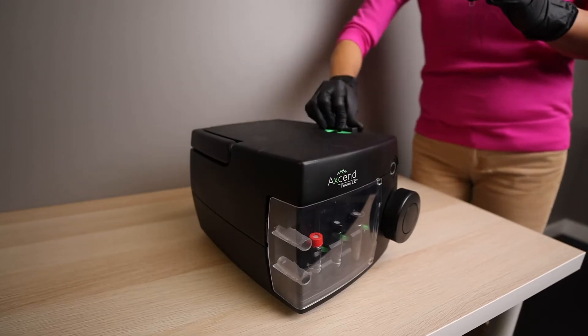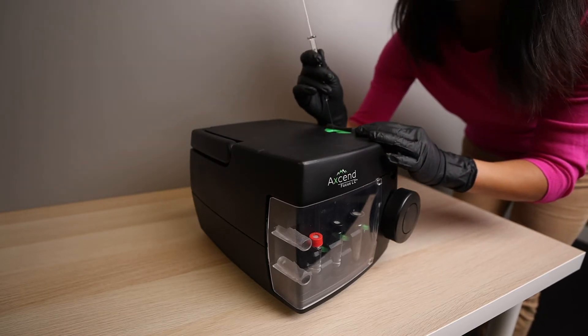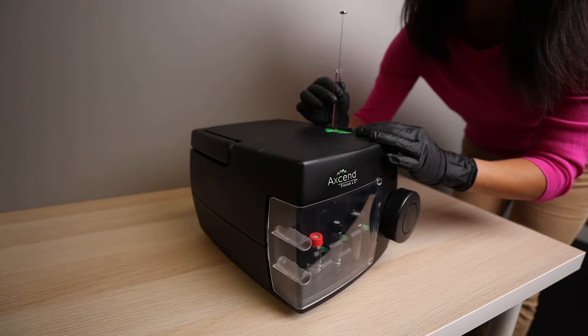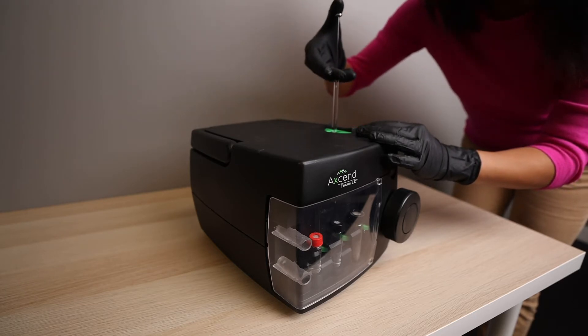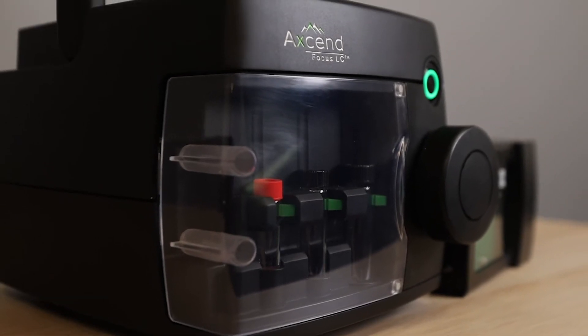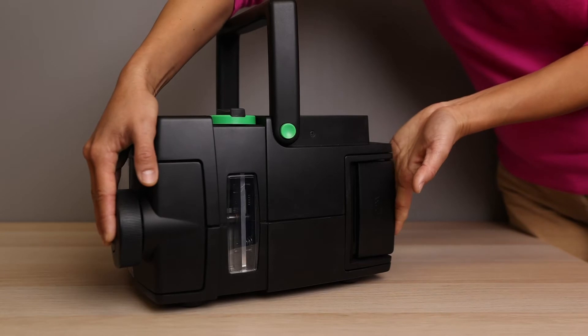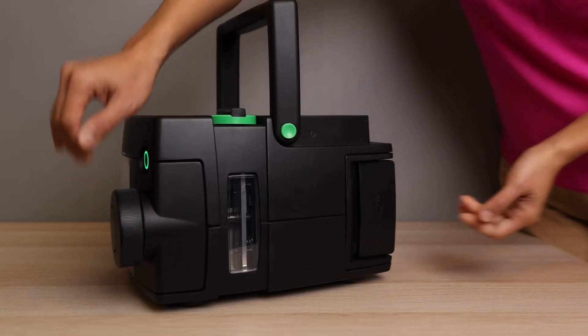As a capillary system, the XenFocus LC uses 1,000 times less solvent than a traditional system. In fact, it uses so little solvent over the course of a day that both solvent and waste vials are carried onboard, further reducing its footprint. This low solvent consumption means the system pays for itself in a little over a year through the reduction in cost of both solvent acquisition and disposal.